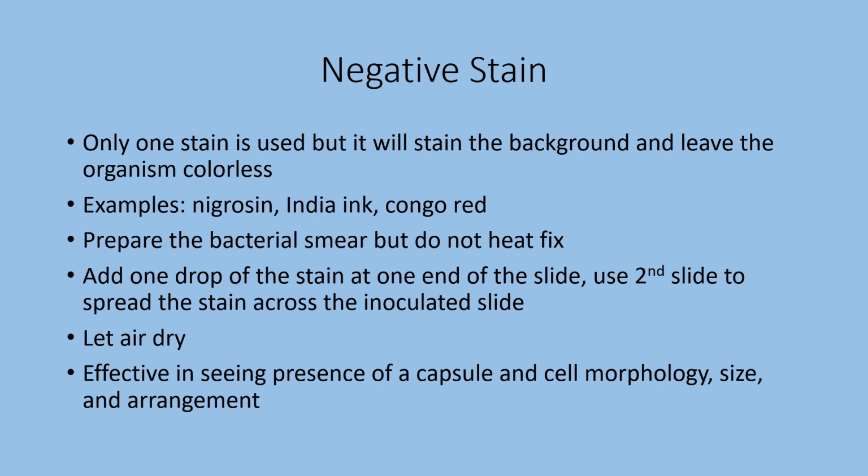Then you take a second slide, and at an angle, you use the second slide to spread that stain across the first slide where you had your organism. You just hold it and slide it all the way across, then let it air dry. After it has air dried, you view it under the microscope.